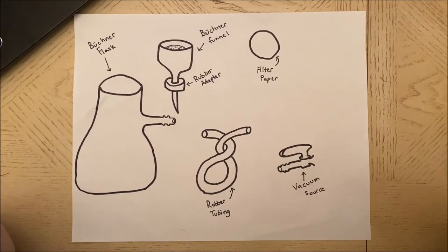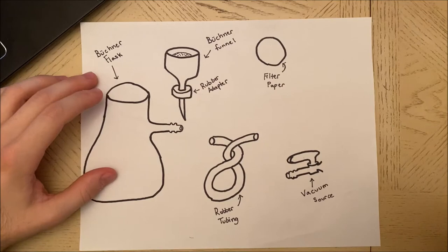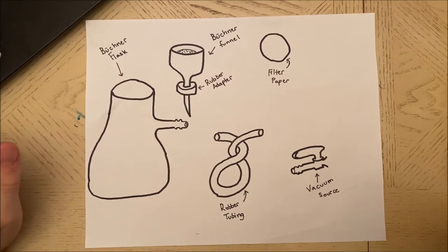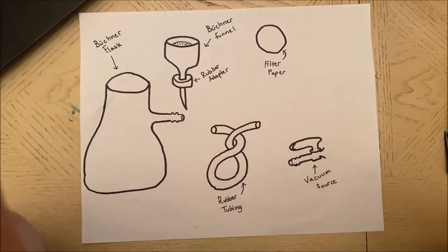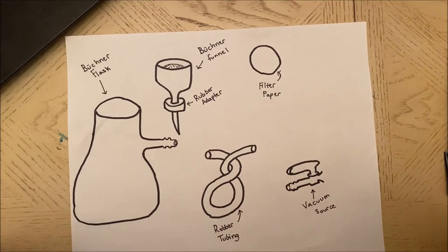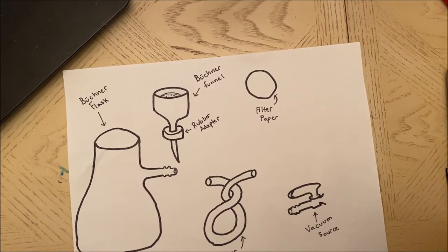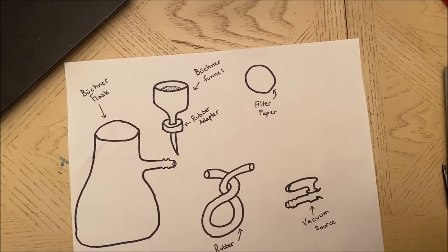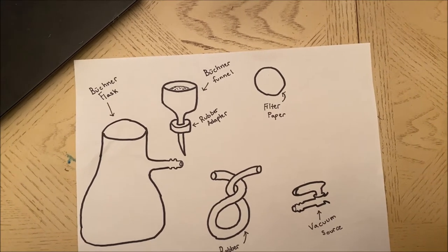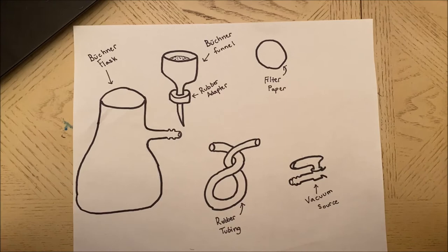So for my lab practicum I decided to explain vacuum filtration. Vacuum filtration is used primarily to collect a desired solid, and an example of this is the collection of crystals in a recrystallization procedure.